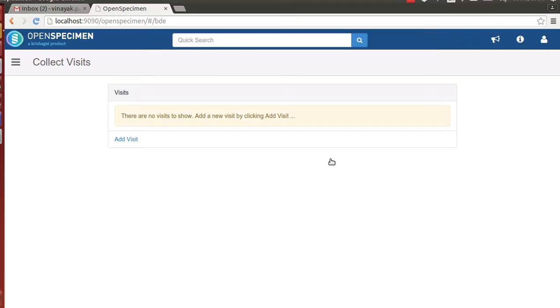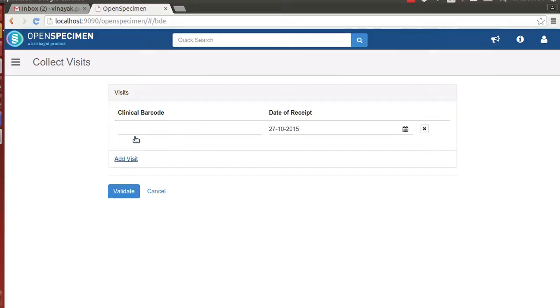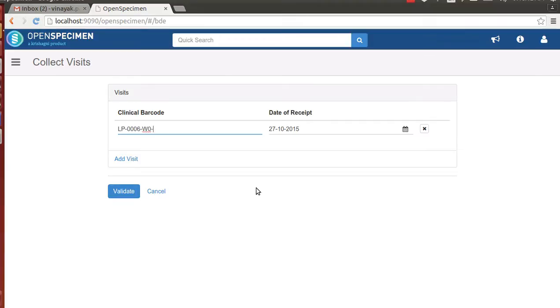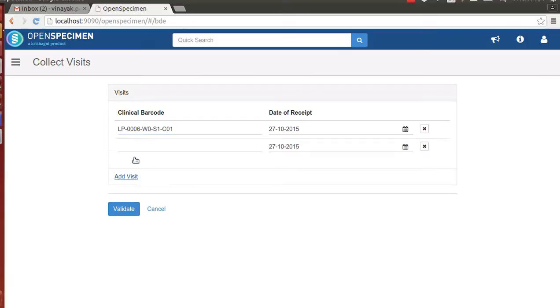On this screen, the technician scans the visit barcodes or referred to as clinical barcodes in this workflow. Let me input a clinical barcode, a valid clinical barcode. Let me input another clinical barcode of a visit belonging to a different patient.